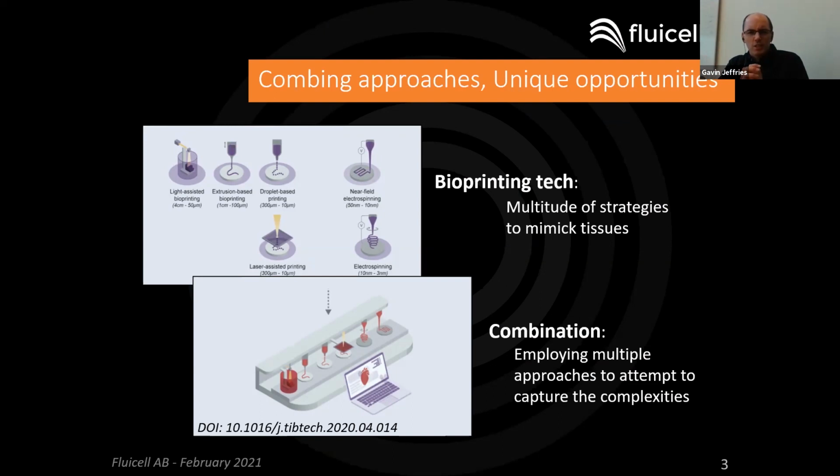However, reproducing this complexity, especially mimicking the architecture of the cellular microenvironment at the individual cell level, still remains quite a great challenge to this day. Of recent focus, there have been a few recent articles describing how to combine these technologies to pull on the benefits of each of these different types of bioprinting technologies. However, this requires that these technologies can be freely deployed and freely integrated along with other technologies. And that's one of the great challenges.